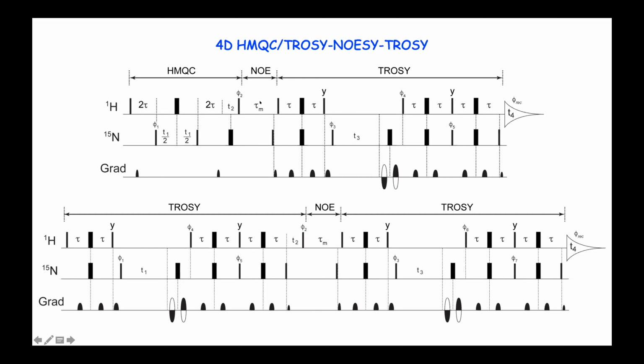Well, the axial peak is always pointed up. And when you phase cycle this pulse, the receiver also goes up and down. So the axial peak is canceled because it's always positive and the receiver goes up and down, positive and negative. So they cancel. However, by phase cycling this pulse, the pulse imperfection of the 90 could still give you a little bit of contribution of the axial peak, but I expect that to be very weak. Should not be a problem at all, okay?